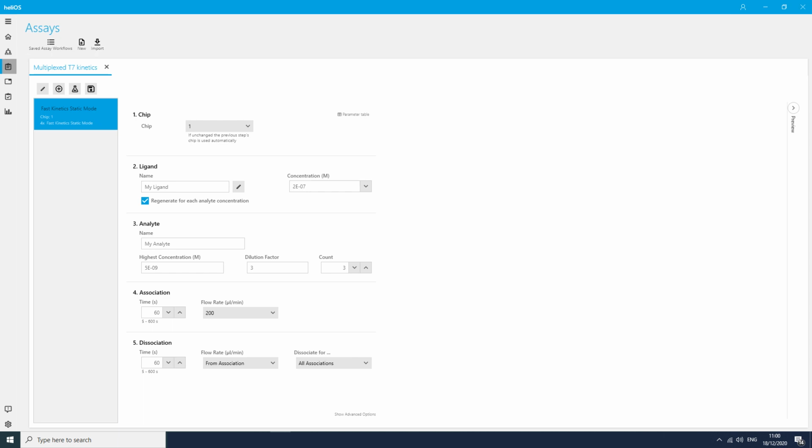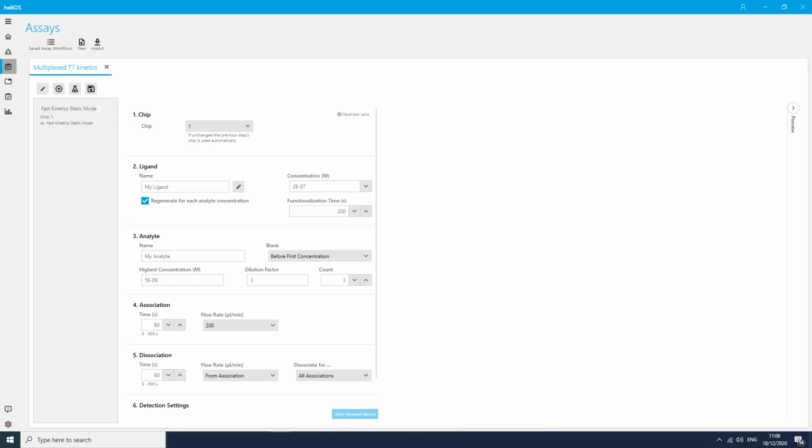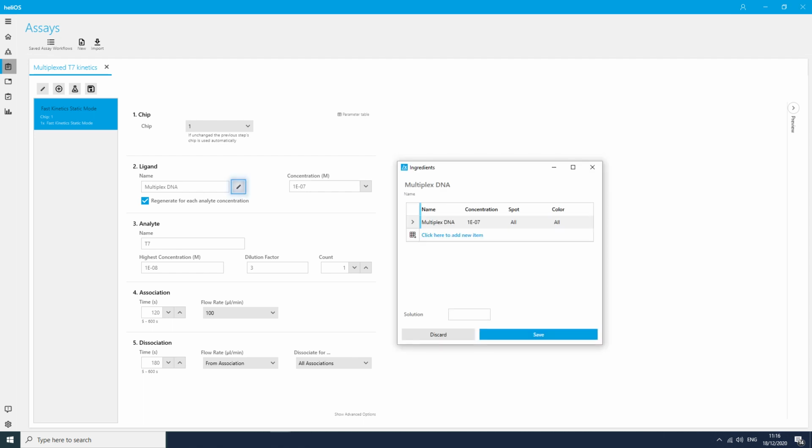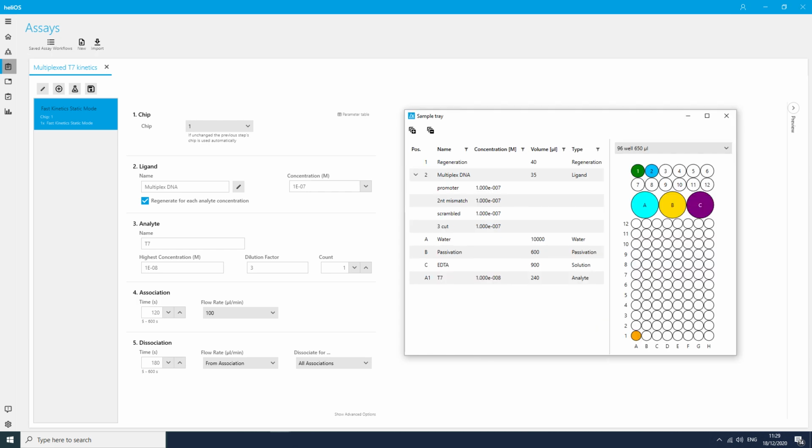The parameter list provides the heliX with all the information it needs to run my kinetic experiment and analyze it afterwards. Importantly, for a multiplexing assay, I will go to the details of the ligand and provide all names and the respective measurement spot and color code. Now I have finished my assay setup and would like to know which samples I actually need. The software is providing me with a list of all required samples in the autosampler tray overview.